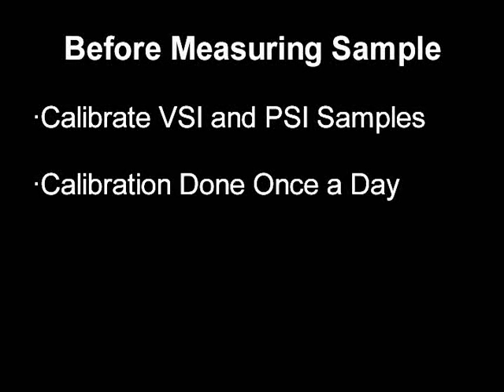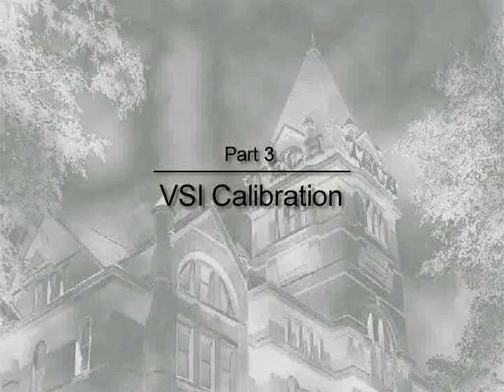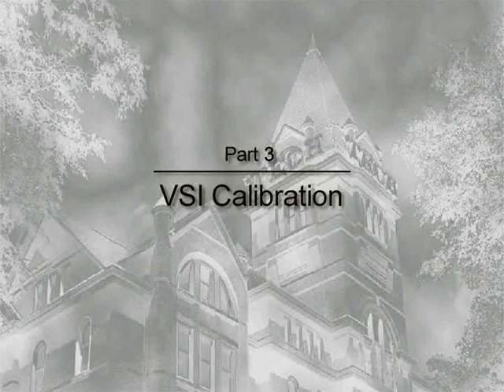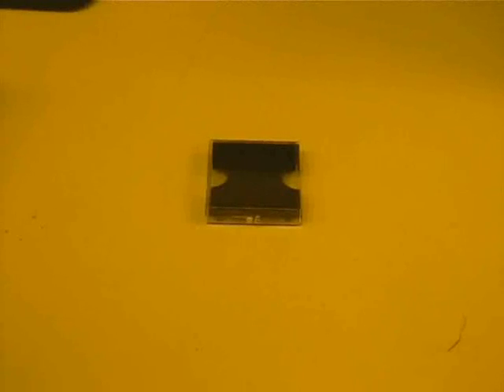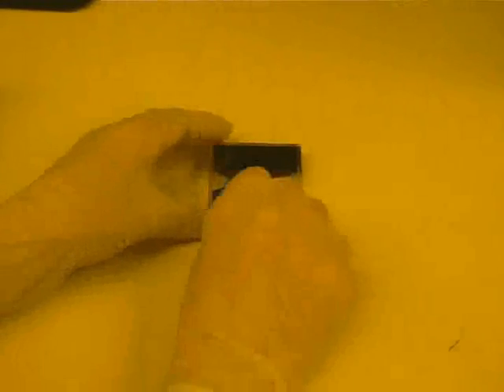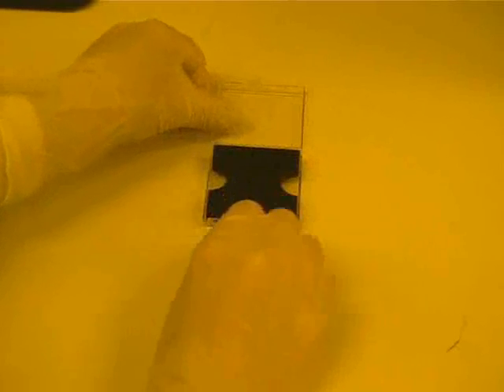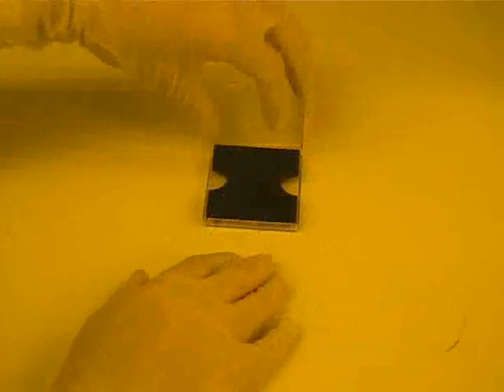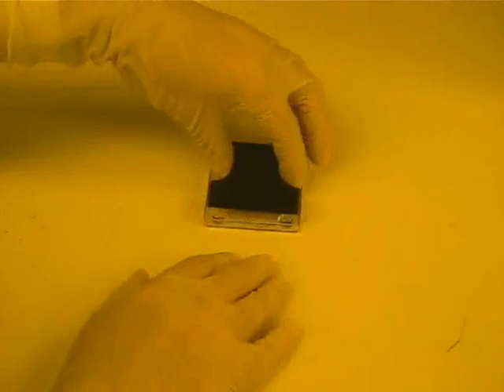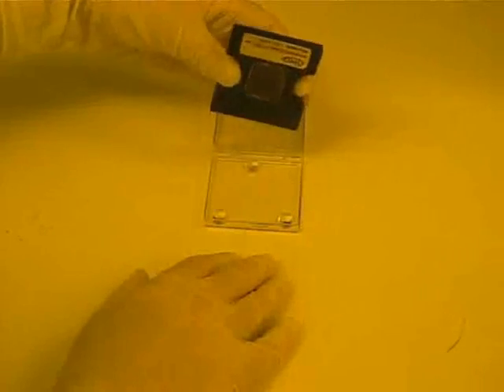Before we perform a measurement on our sample, we need to calibrate both the VSI and PSI samples. This should be done at least once a day in order to ensure accurate data. The VSI calibration sample is stored in a plastic box. We store the VSI calibration sample face down to prevent contamination from landing on the surface.